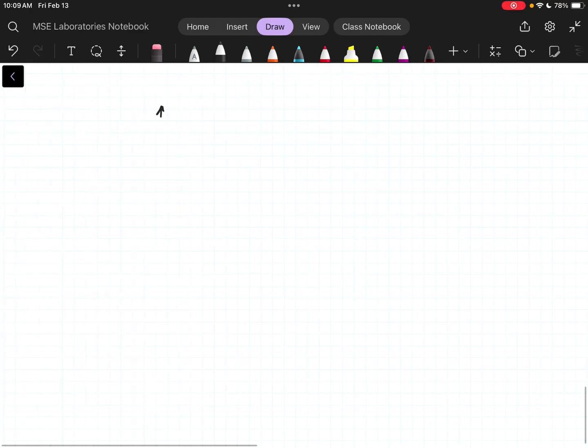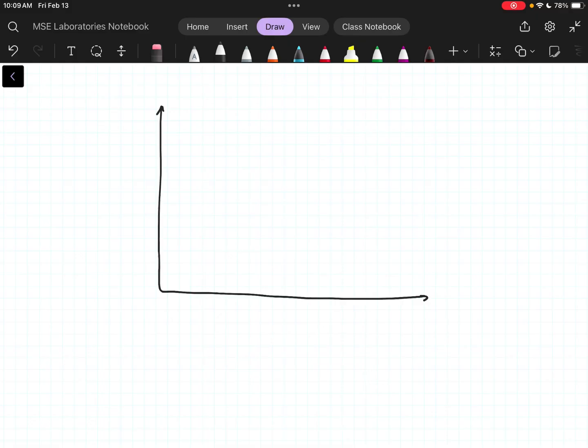Again, in this case, if we have to pit them against each other, we err on the side of the instrument, of the technique that we need the most. In some cases, we might find that it is better to run a good quality DSC scan and also a good quality TGA scan in two different instruments or in two different tests. We lose a little bit of the time relational, nice pretty stuff. If you're doing off temperature, then you're probably fine. But as long as you normalize the temperature, it's probably fine. And if you use the same instrument, then it probably is going to be okay.